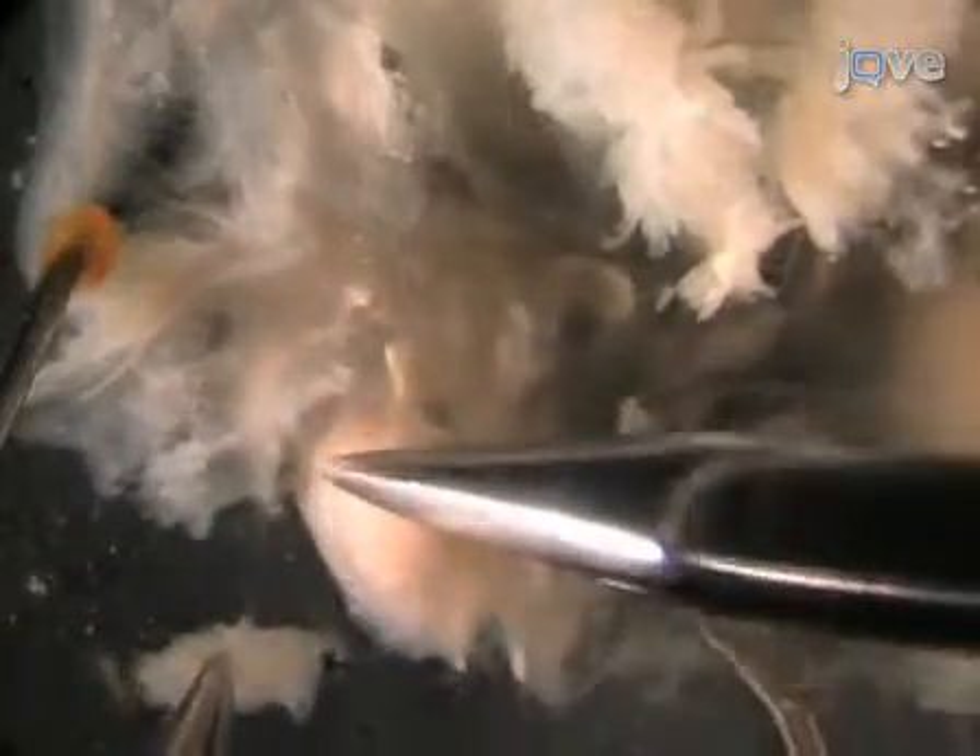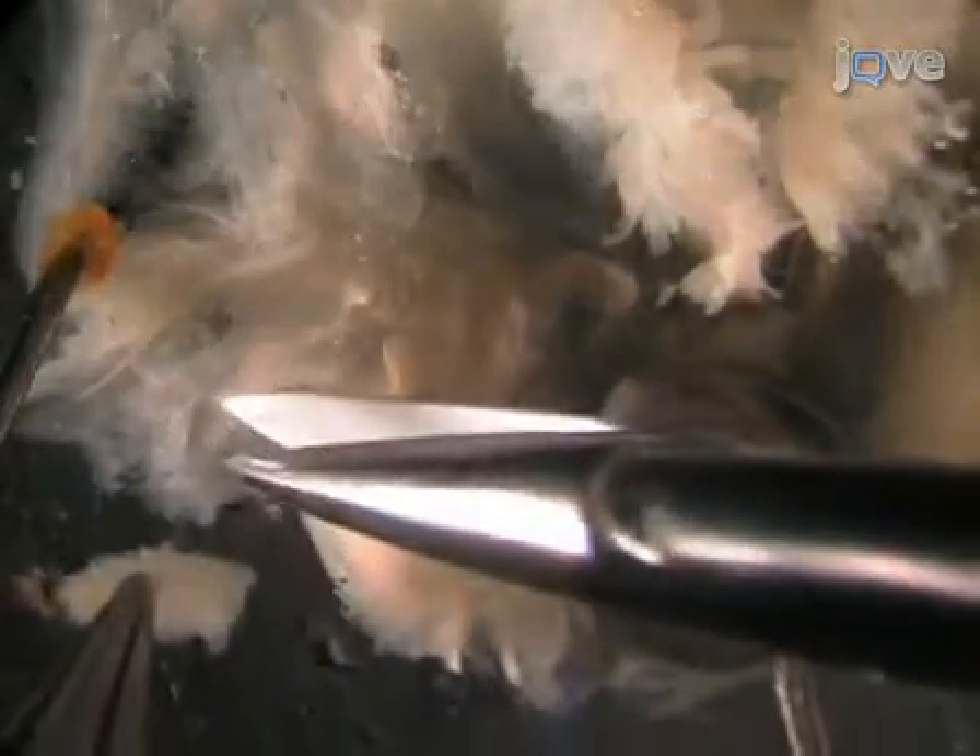Be sure to leave some muscle attached to one of these nerves as a marker to identify them from each other.